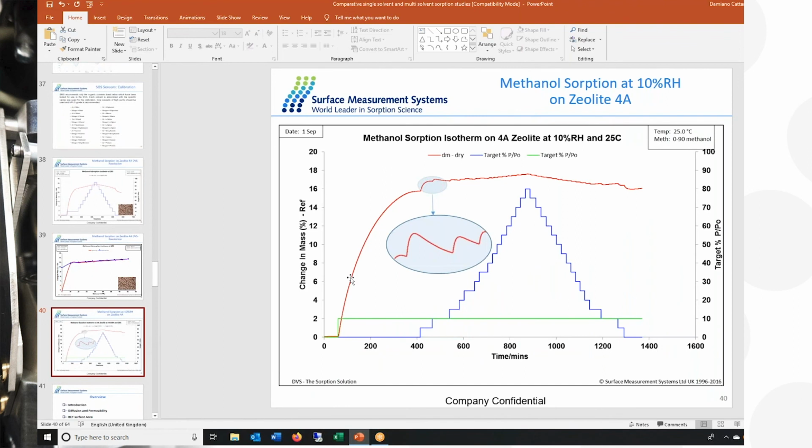So you're asking if we could measure the difference here using Raman or using DVS? DVS. The example you're talking about is zeolite, right? The things only stay on the surface, and then you're talking about a hysteresis. However, if you have a sample where your probe really goes into the material, not on the surface, would you observe the same hysteresis?